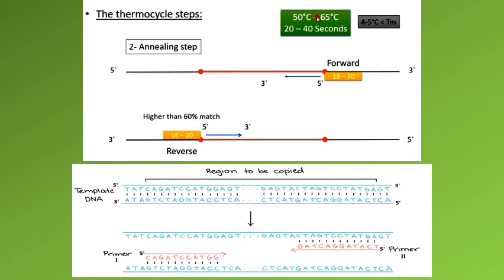So if you calculated the Tm of any primer at 60, the annealing temperature is calculated as 55. When Tm is 60, the annealing temperature is lower by 5 degrees and becomes 55 degrees, and so on.